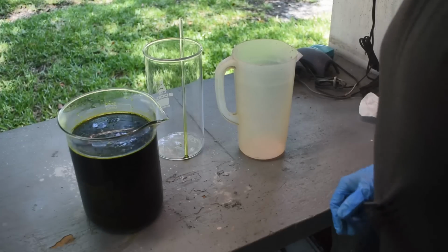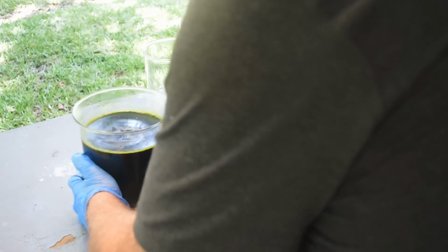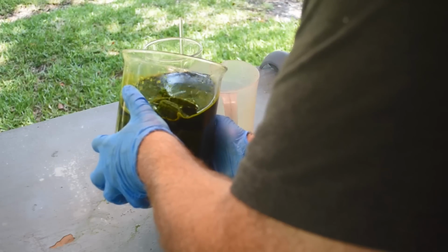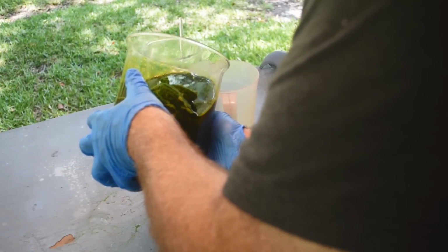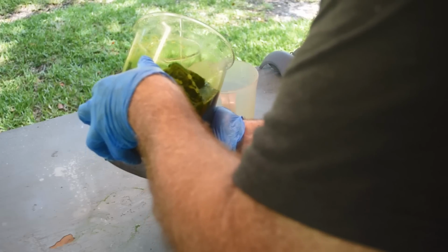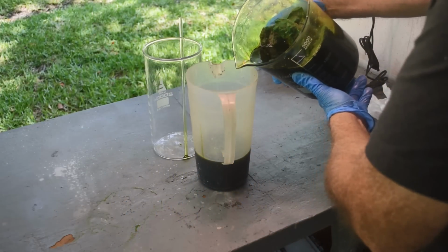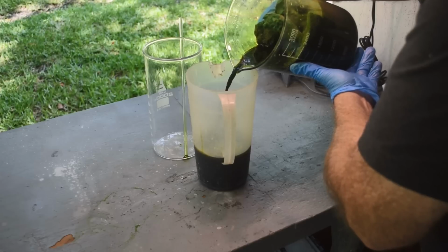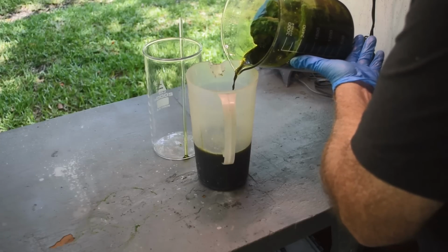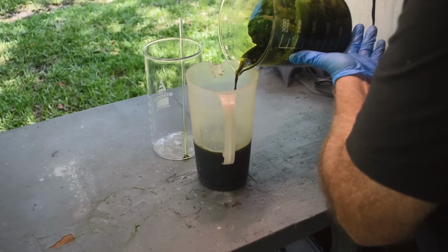All right, so my plan here is to pour this liquid off into this pitcher, and then I will dole out a little bit of it at a time to this big beaker back here and denox it. And this will give us a look at what in the world we've got in this beaker solid-wise down here. Oh, it's really heavy. Let me turn this so maybe you can see in it better. Yeah, there's a lot of solids here. I didn't think I'd put that much sodium nitrate in there. You might have something other than sodium chloride here too.